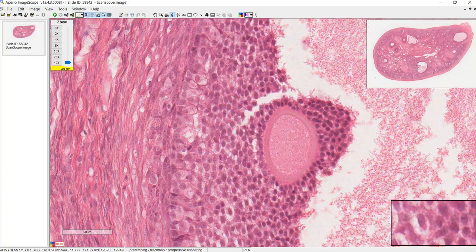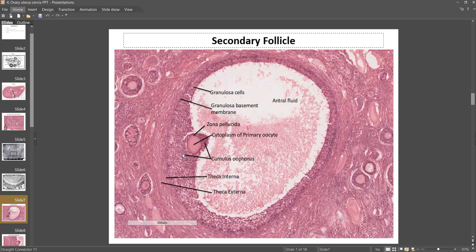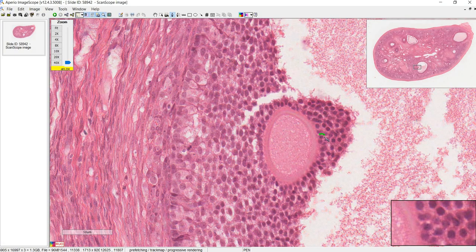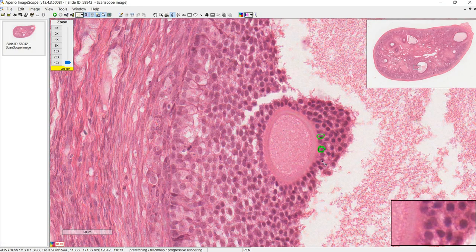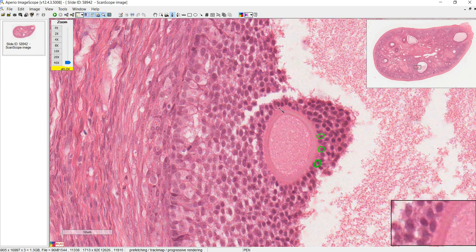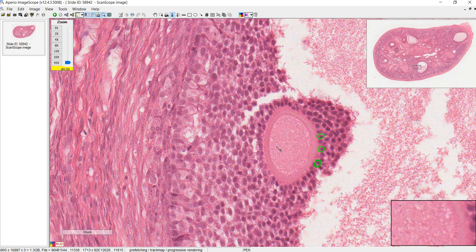The cumulus oophorus cells are the granulosa cells that are around the oocyte. The innermost layer of the cumulus oophorus has a special name: the corona radiata. The cells right next to the zona pellucida make up the corona radiata, and those are the cells that leave with the oocyte during ovulation.